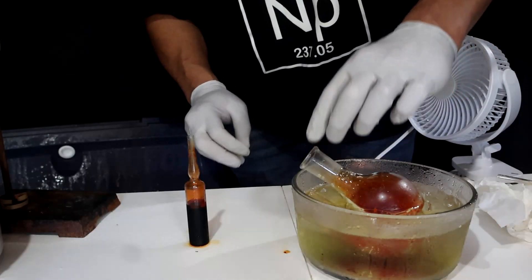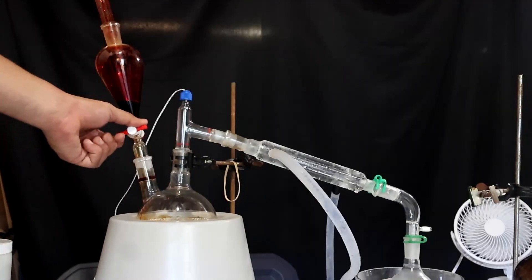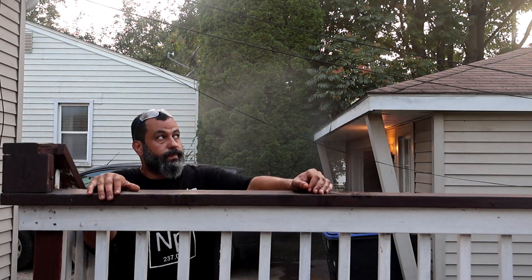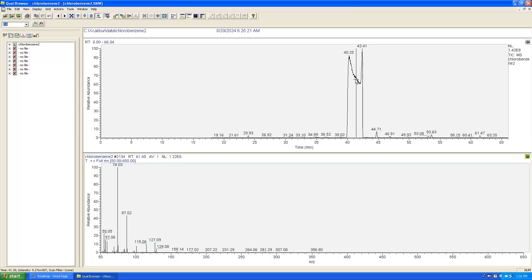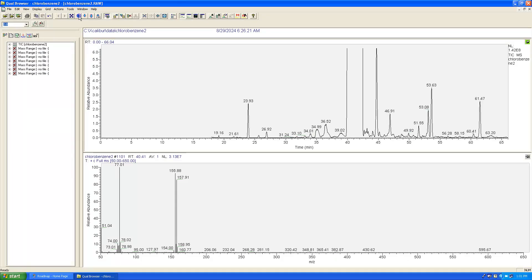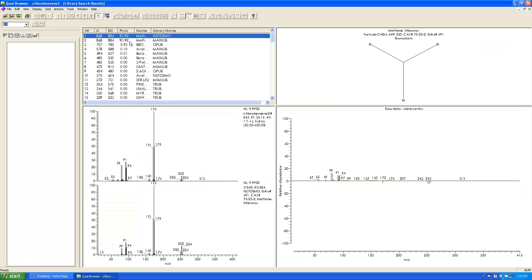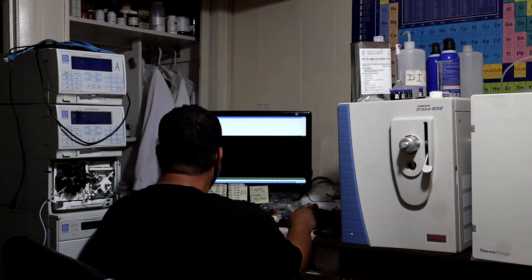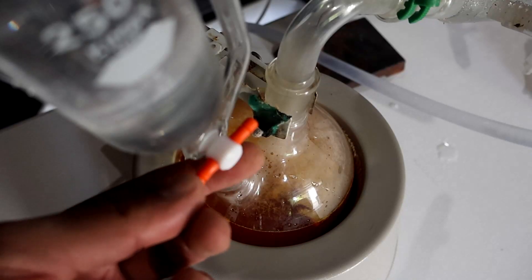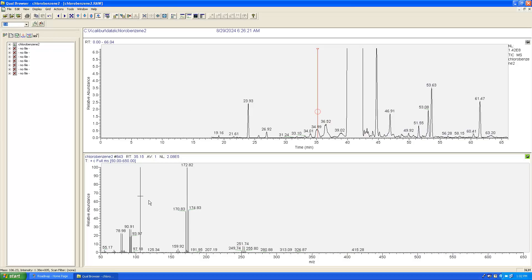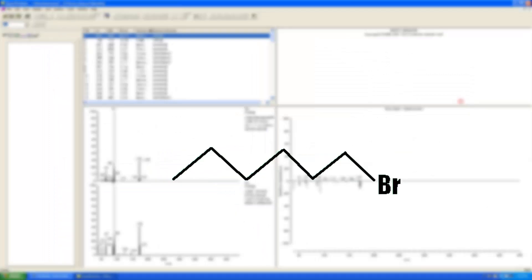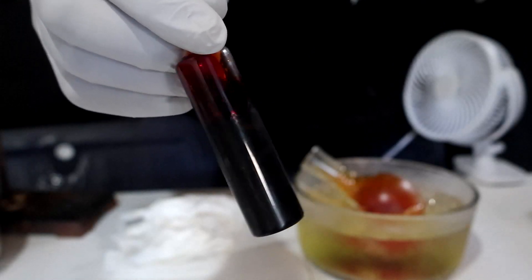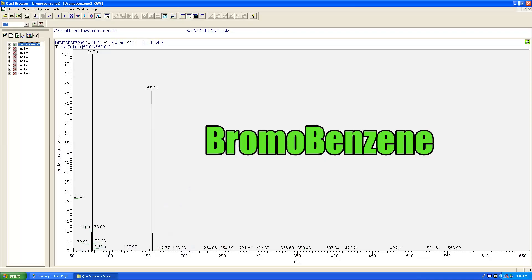So I made a bit of bromine first, displacing it from sodium bromide with chlorine. My bromine is then slowly added to room temperature benzene in the presence of some iron. The reaction is exothermic — it released a lot of hydrogen bromide fumes, so I'm glad I did it in my garage. Bromobenzene is this large peak here, but if I zoom in on the low level down there, there is also some tribromomethane. I don't know if bromine is capable of completely destroying a benzene ring or if some acetone contamination resulted in this side product — let me know in the comments if you have any idea. Now because I used chlorine to displace bromine, and since the two are always contaminating each other, a few chlorinated molecules are present as well. I also found some traces of bromoheptane and benzobromide. The interesting thing about bromine is the two isotopes in almost equal quantity, bromine-79 and bromine-81, which gives this double mass for every brominated compound, like the ultimate fingerprint.